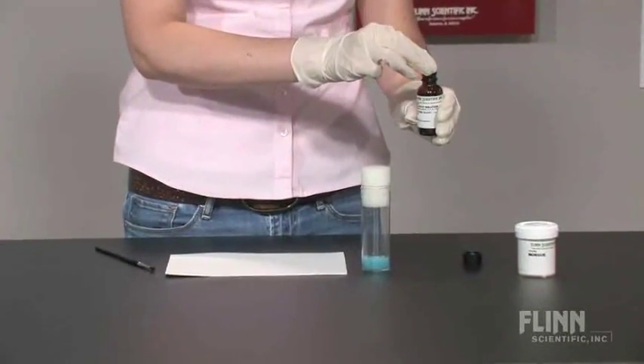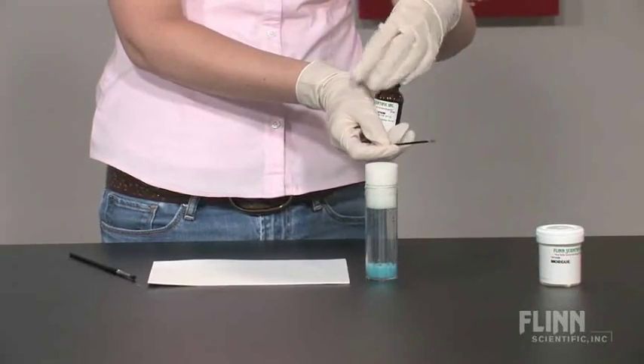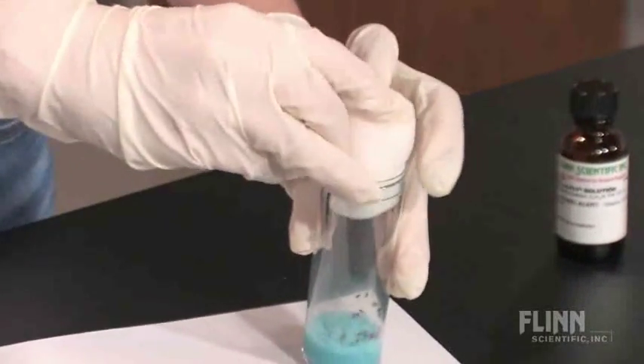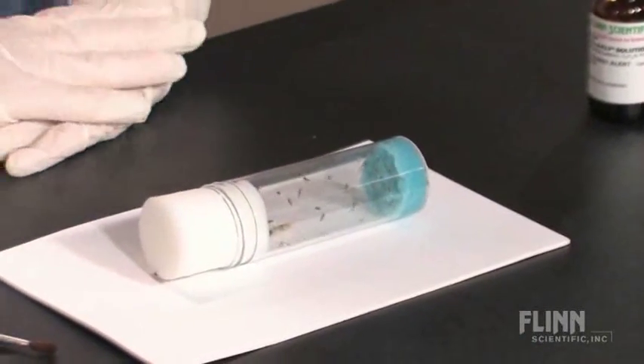Insert the tip of the wand into the lullifly solution, then recap the lullifly solution immediately. Gently tap the vial of Drosophila on the table so that the flies are knocked to the bottom of the vial. Quickly remove the foam plug and insert the wand into the vial just below the plug.